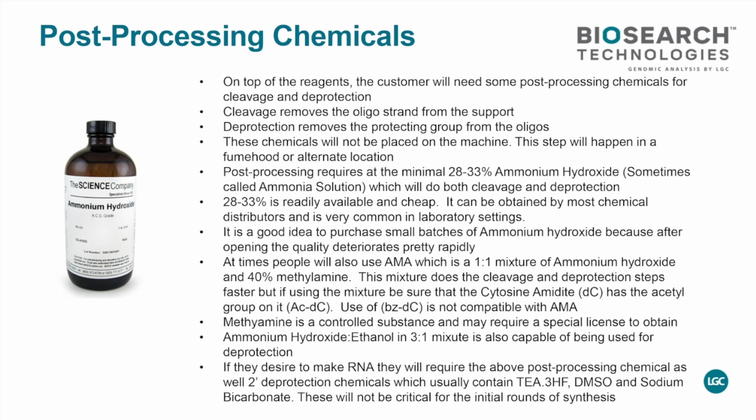After about 20 openings and closings of the bottle, the ammonia will actually exhaust itself. The percent will go down quite significantly, and your cleavage would not work. So you would lose your oligo, it would still sit on the bead, or your protecting groups are not going to be removed properly. So you will lose your yield and return on investment, so to speak.